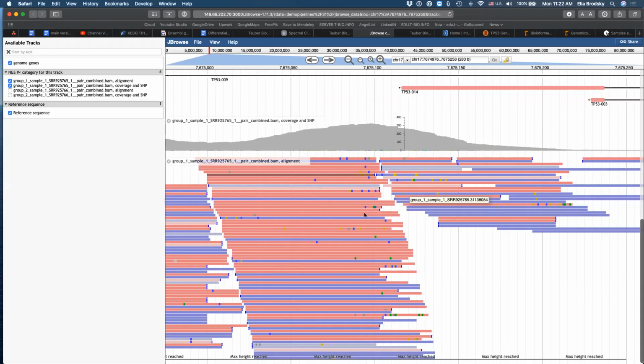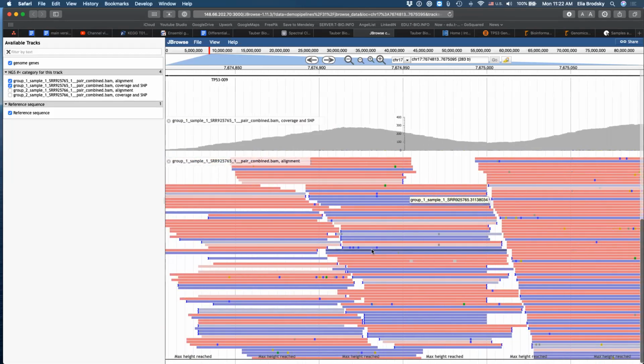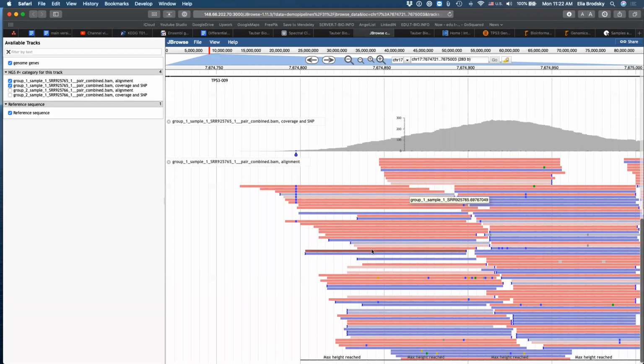So here you can see those different variants that are found in just a single read, and those are essentially insignificant. Once they become multiplied in multiple reads aligned, we start having more confidence that this is a change. But nevertheless, here, for example, you only see 8 reads that contain this change, right? So if I see something happen 8 times from different reads aligned to the same place, I'm starting to think, okay, maybe there's something to it.